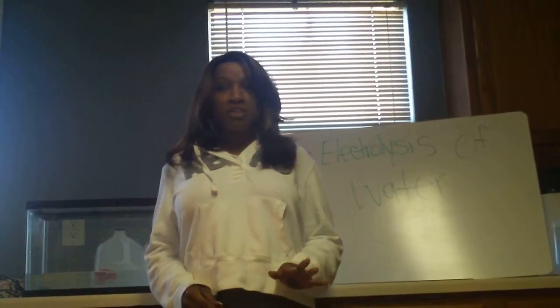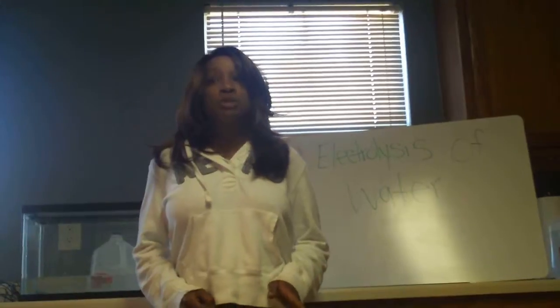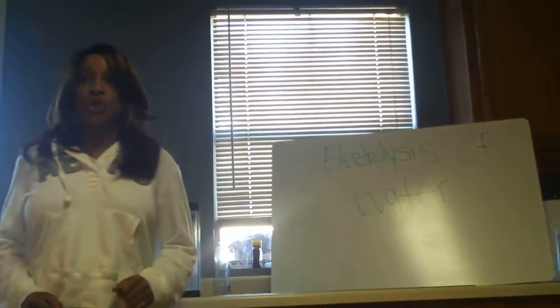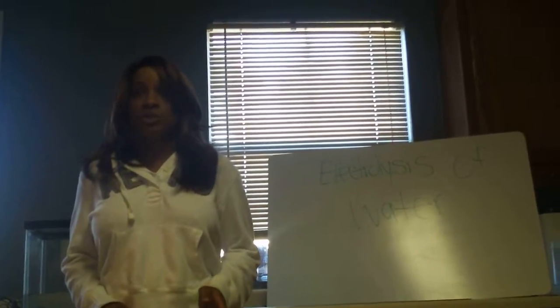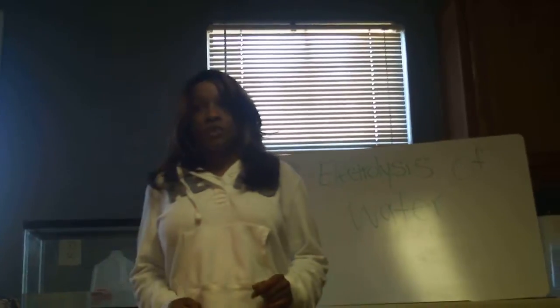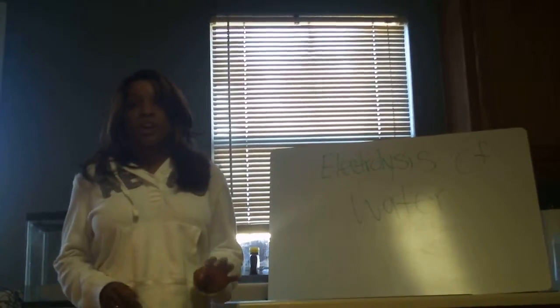I'm not sure if I'm saying that right. And that is where electrical energy provided to the cell is being used to decompose chemical compounds. Or positive, when the cell is galvanic, and that is where reactions are used to generate energy. Today, our cathode will be negative because we'll be using an electrolytic cell.